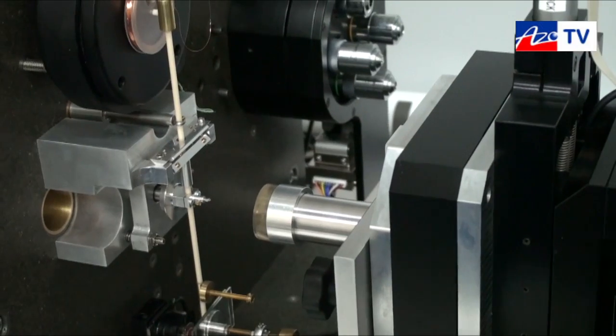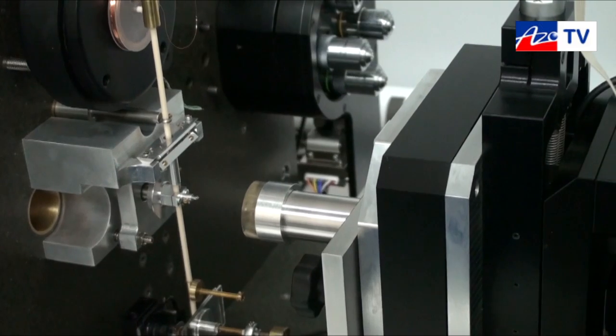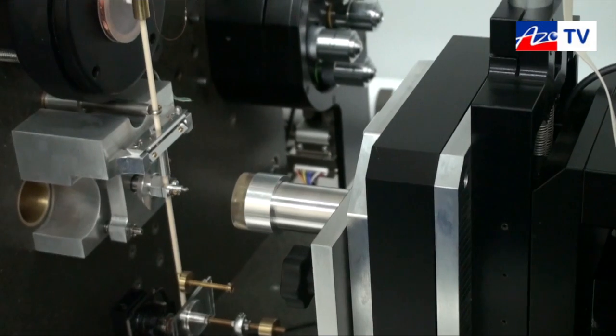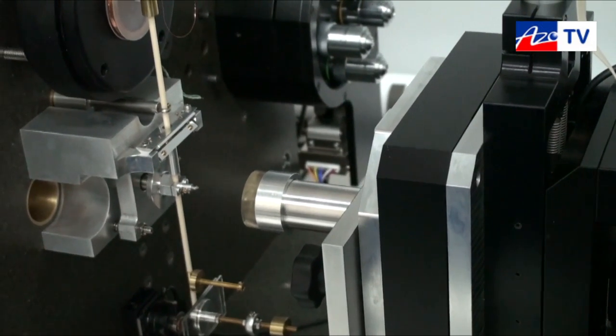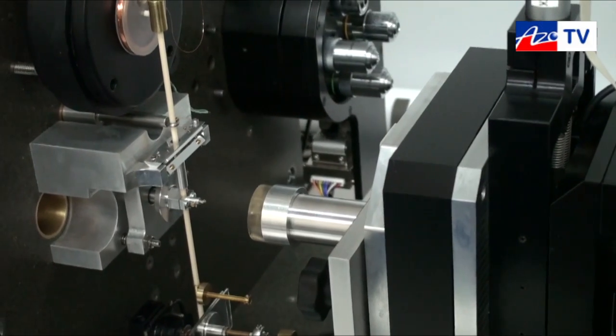That's actually now driving in towards the indenter. Set up in the calibrations, we've got a safe stopping distance if you like. It will move in quite quickly up to a certain distance. It's set at 30 microns back from where the indenter is and then it will cover that last 30 microns slightly slower.